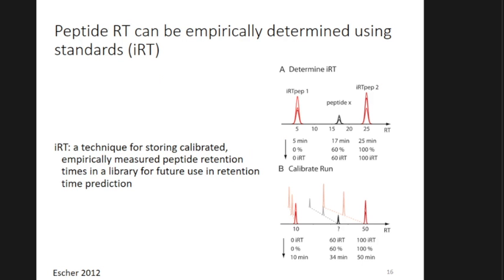All right. So switching gears only slightly, a different way to predict retention time, and depending on who you ask, the better way of predicting retention time, is to have an empirical measure of it. Before, we were just taking the sequence, so one of the questions was, what if I have a modified peptide? Will that change this?